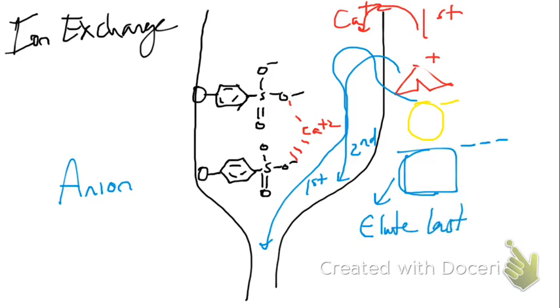And the big key, and the reason why isoelectric points are very important, is because of this type of ion exchange chromatography. Changing pH buffers will allow these changes in charge of these proteins to allow for elution or binding of these specific proteins. And so that's the second type.